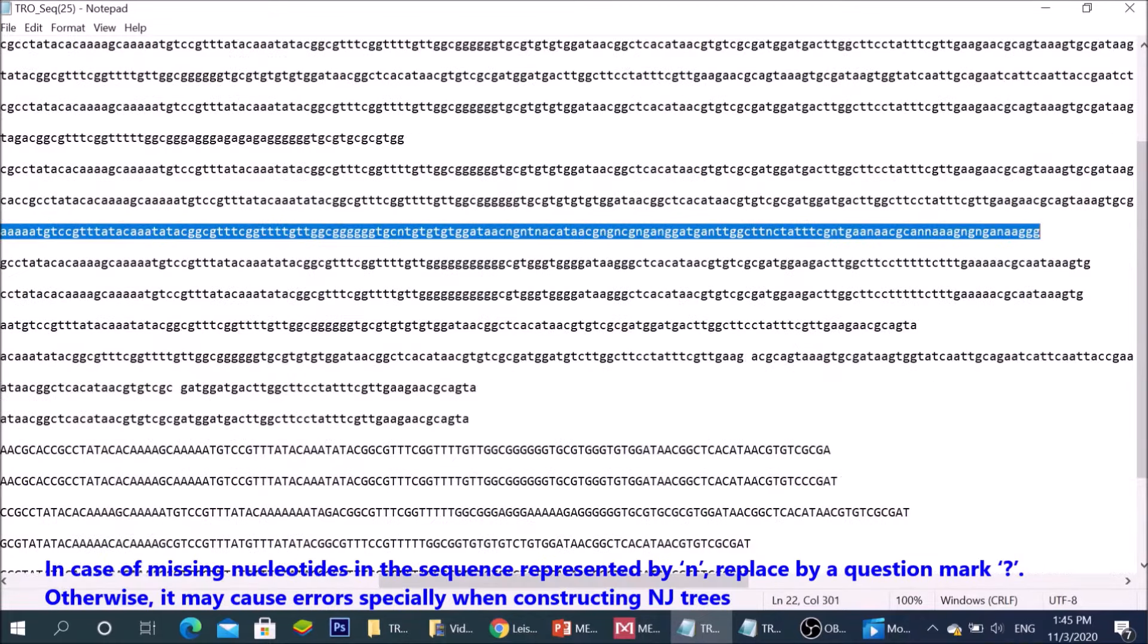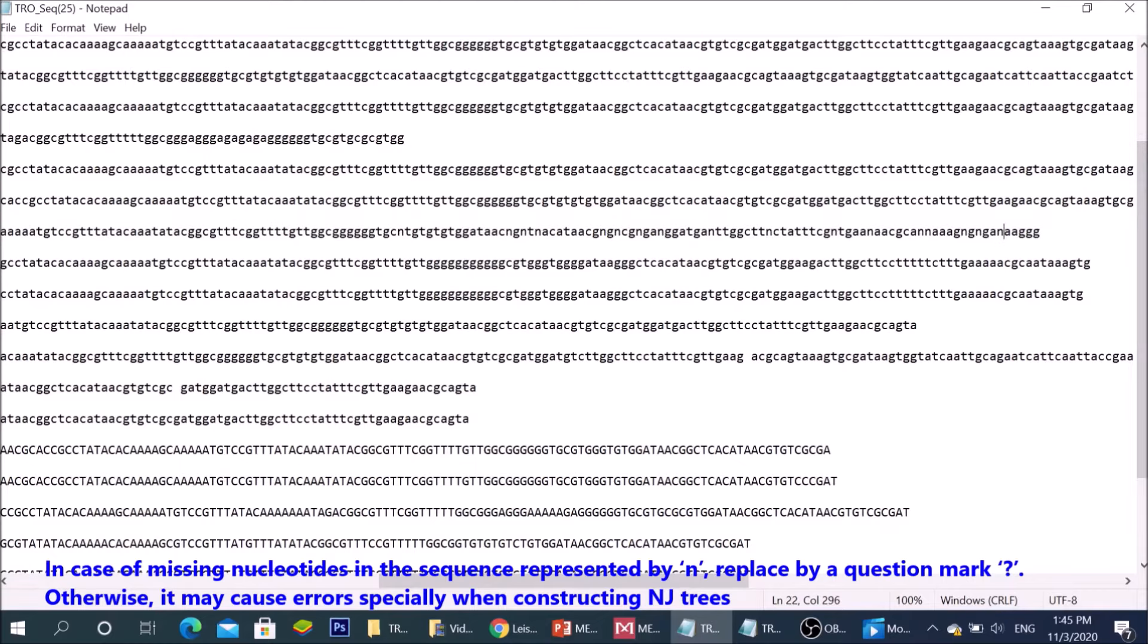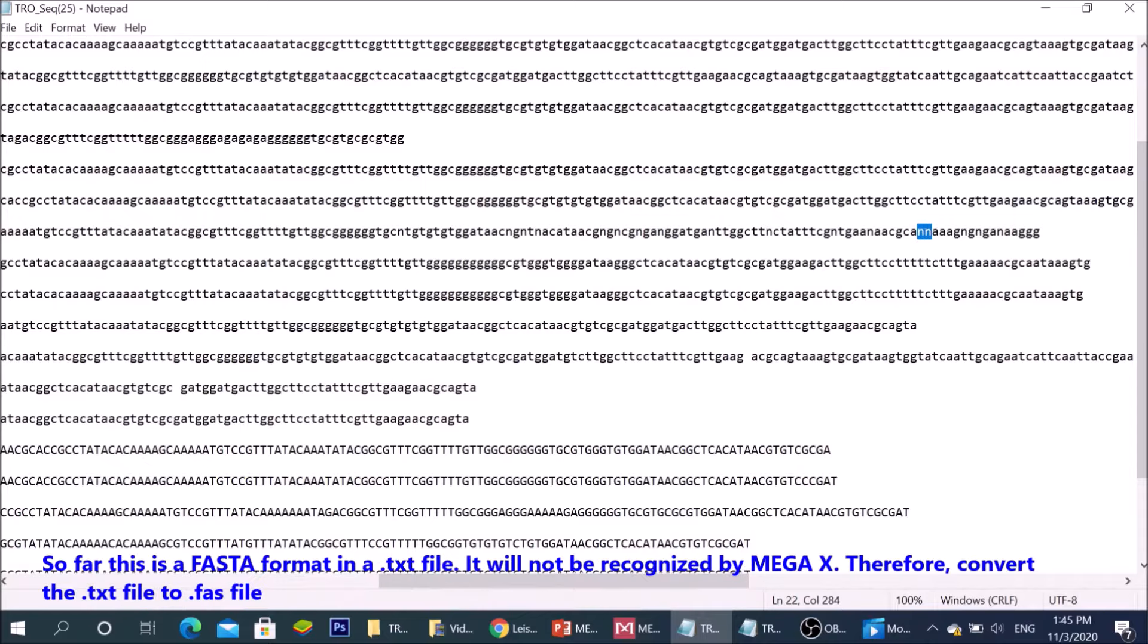In case of missing nucleotides in the sequence, represented by N, replace by a question mark. Otherwise, it may cause errors, especially when constructing neighbor joining trees.